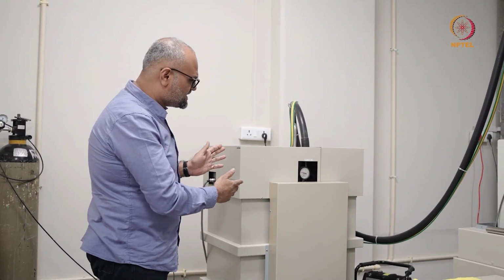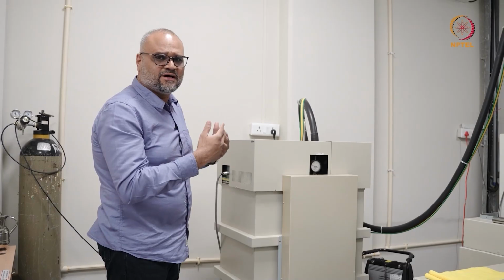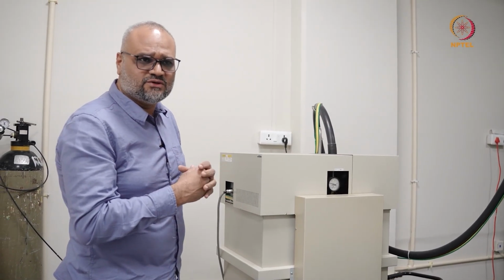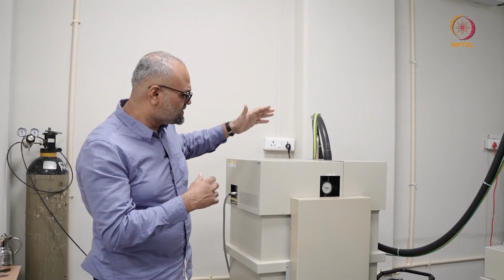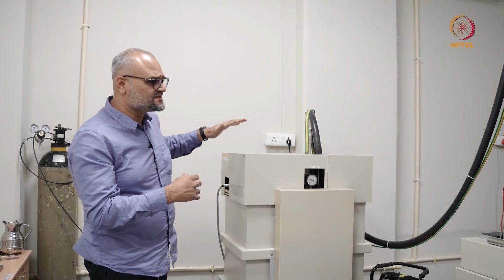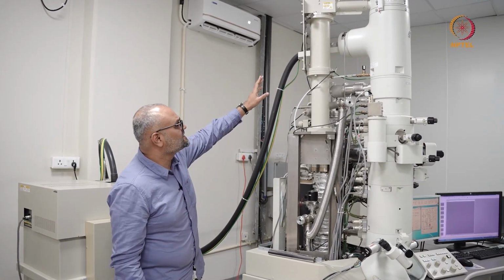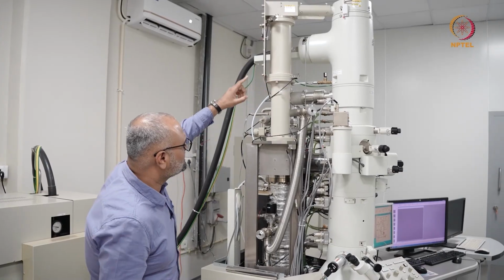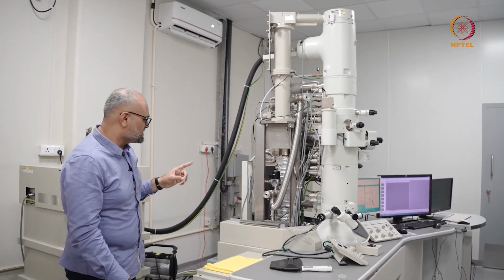The high tension tank is essentially acting like a step-up transformer, where you're withdrawing power from the main line, either at 100 or 230 volts, and then it runs through a loop over there, and the high tension tank acts as a step-up transformer. So here is the cable which is connected to the microscope column near the source on the top, and the electrons are accelerated through 200 kilovolts in this particular column.